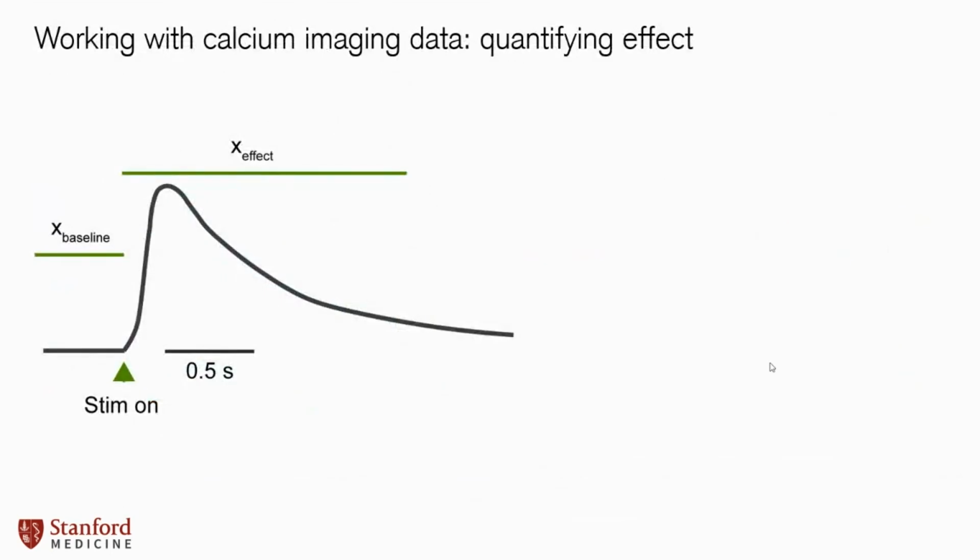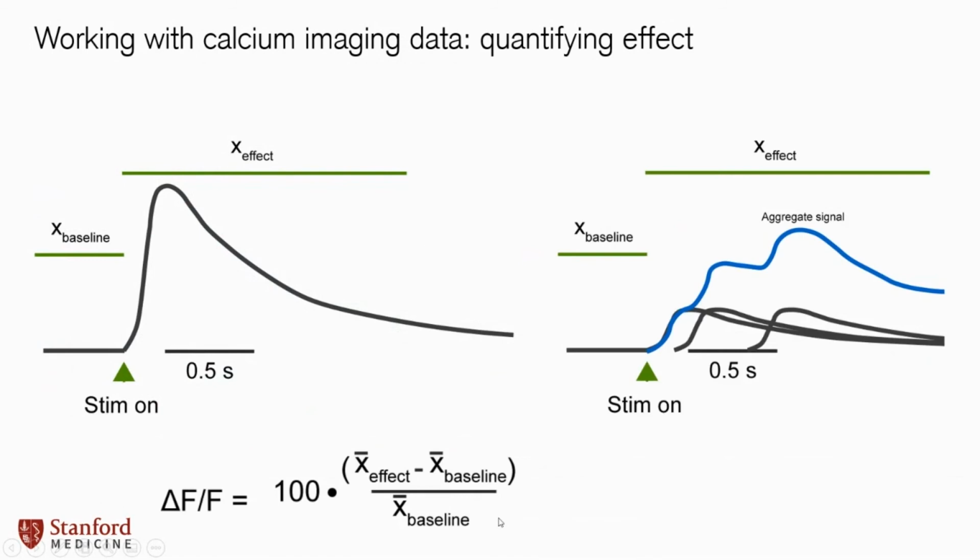And working with this data, what researchers will typically do, including myself, is to have some baseline period and then to have a stimulation event. In our case, that would be ultrasound. And then to look at the aggregate or area under the curve following the stimulation, and then just to compare that to baseline. And you can use this equation down here if you're interested in doing that. And you're never really just looking at one cell where you get this really clean response. You're usually looking at a bunch of cells that summate in space and time. So your aggregate signal will look much noisier than this shown on the left.